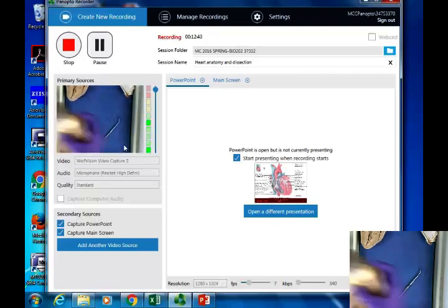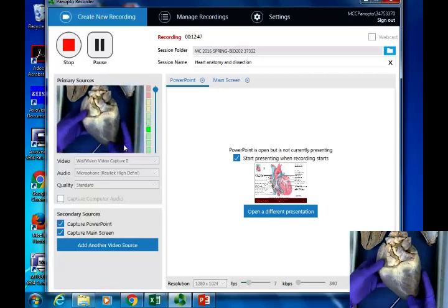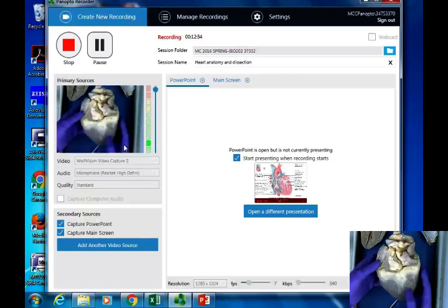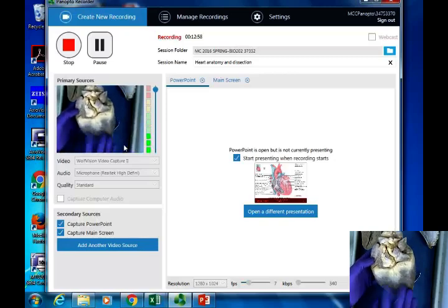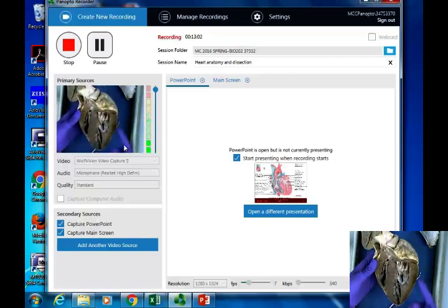This one is a bit bigger still. Okay. So again, you can see some of our interventricular vessels on the surface here. Now, we can't really tell right off the bat whether this is the front or the back, anterior or posterior. But when we look inside, now we're figuring, okay, here's the thick side.